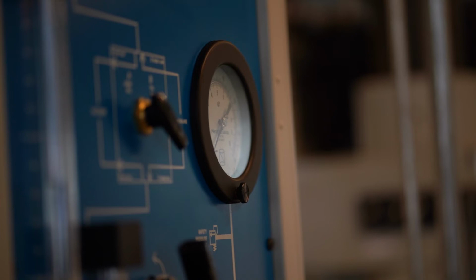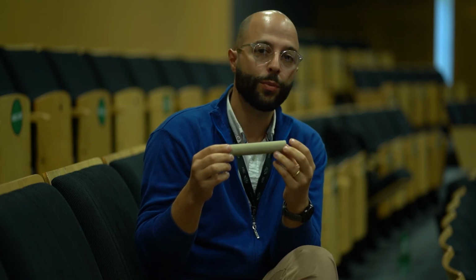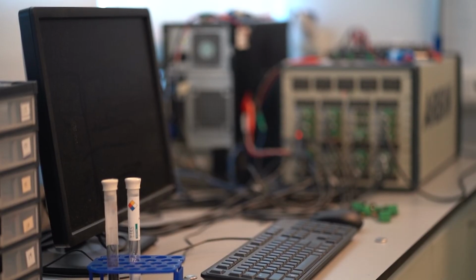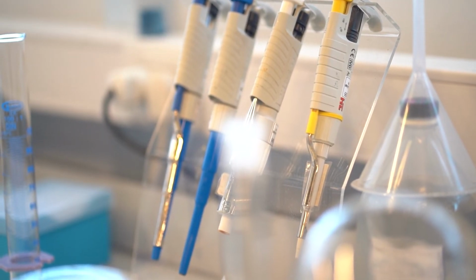Okay, once you know this permeability, then you may want to model this, use this for a model. So the first thing you do is you try to see if some formula or some numerical experiment can explain your conditions, the amount of pressure you put, the amount of flow you got on the other side. And if you know that, you may be able to say, okay, the formation where this sample has been drawn reacts with such amount of flow per unit area when we apply this pressure. So that's the path, but we can do certainly a lot of other stuff.